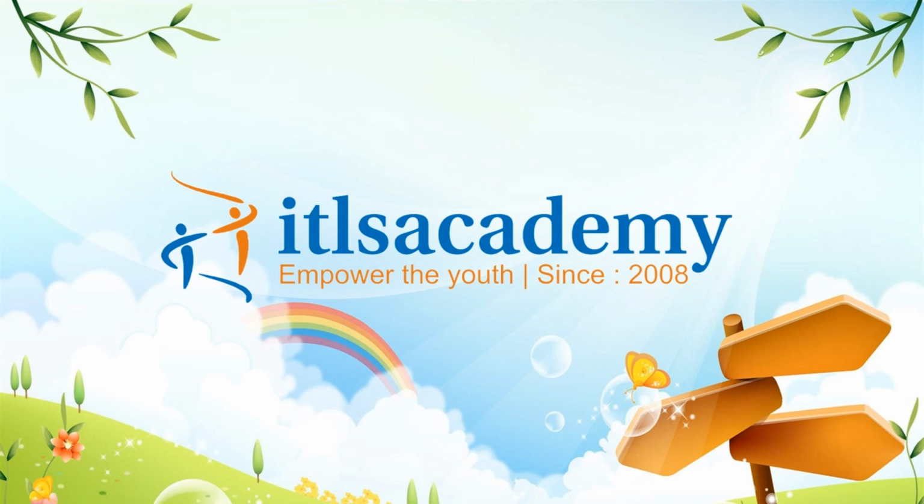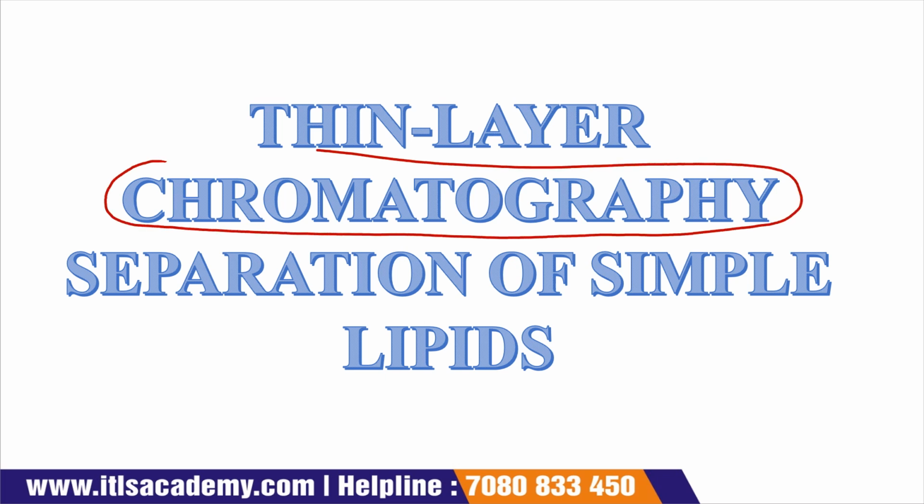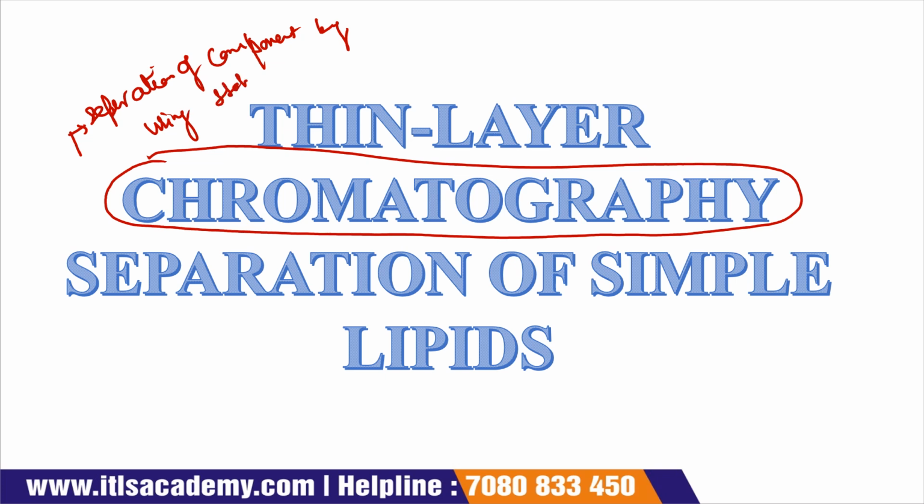Today we are going to discuss the topic thin layer chromatography separation of simple lipids. What does the word chromatography mean? Chromatography simply means separation of components by using a stationary phase and a mobile phase.